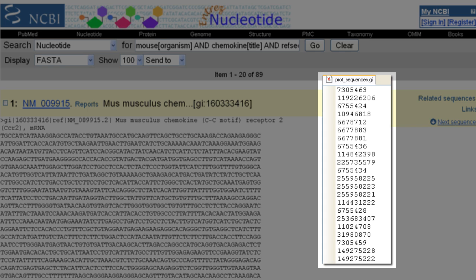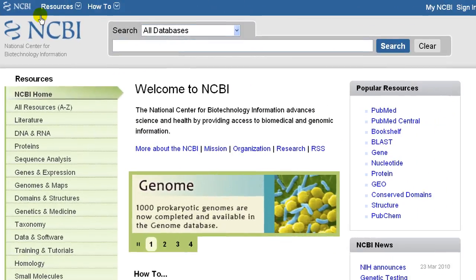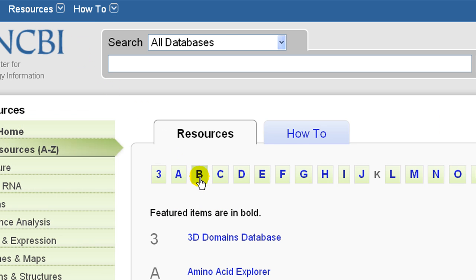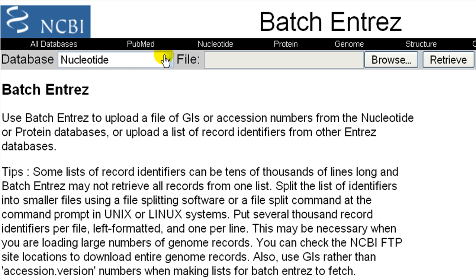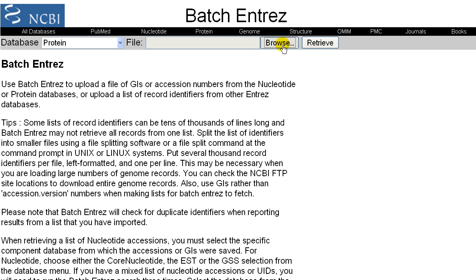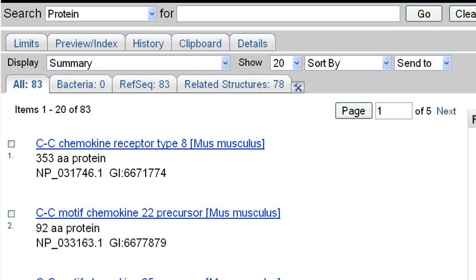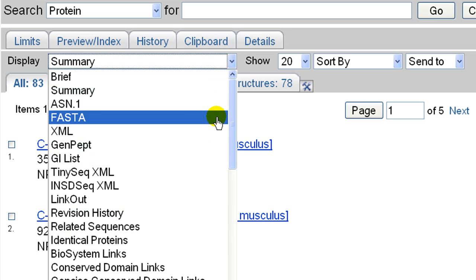Let's say a colleague sent you a list of protein GI numbers for which you'd like the FASTA sequences. Go to the Batch Entrez page and select the correct database — protein in this case. Browse to your local file of identifiers and click Retrieve. You can then change display to FASTA and send to a local file.